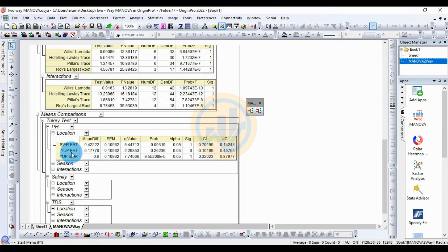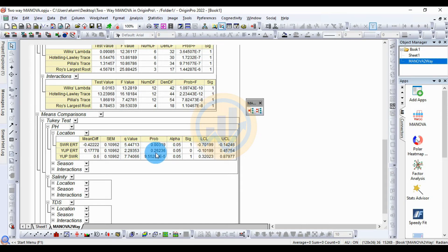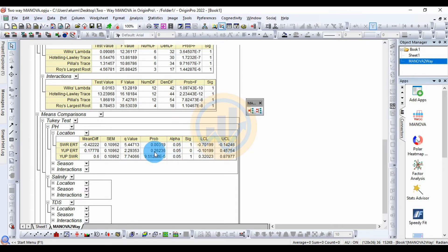For YUP vs ERT location comparison: mean difference 0.1778, standard error 0.10962, q-value 2.29353, p-value 0.26236, standard significance value 0.05, significant indicator 0 — statistically not significant, because our p-value 0.26 is higher than the standard significance value of 0.05. The LCL value is minus 0.10199 and the UCL value is 0.45754.